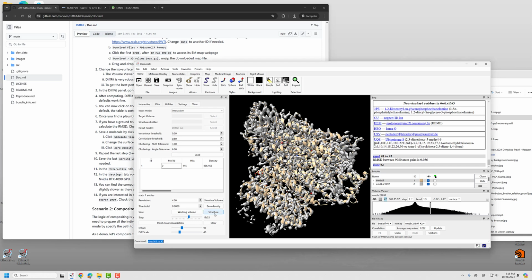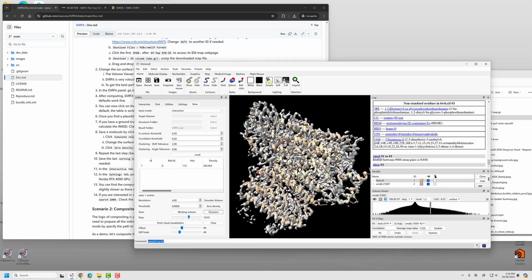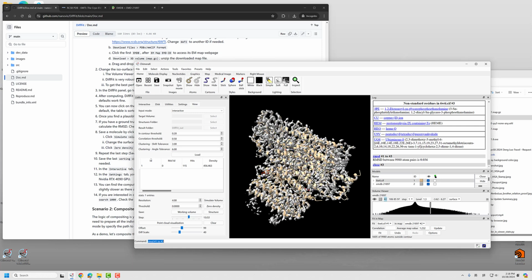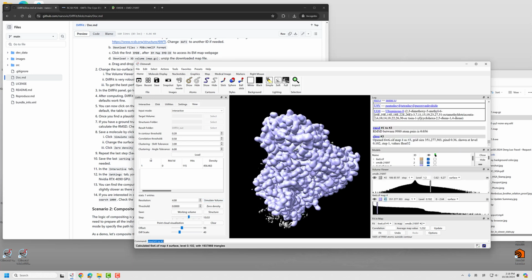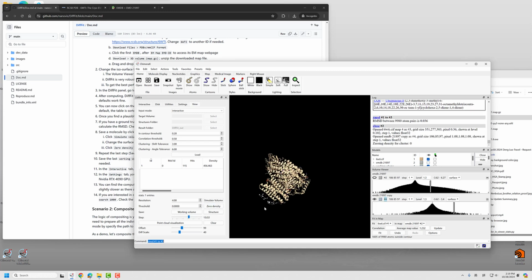You can save the structure anywhere. One more thing: this will not make a big difference here in this single volume that has a single structure, but when the volume is large with more than one subunit, you can simulate a volume, and then imagine there are other densities around this box. Then you can zero the density, and what's left is shown here.